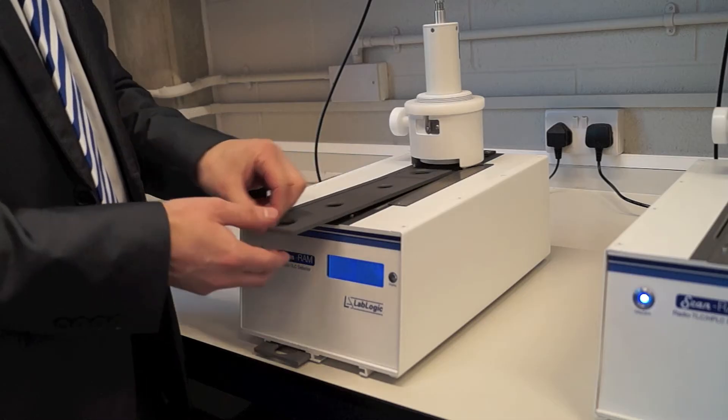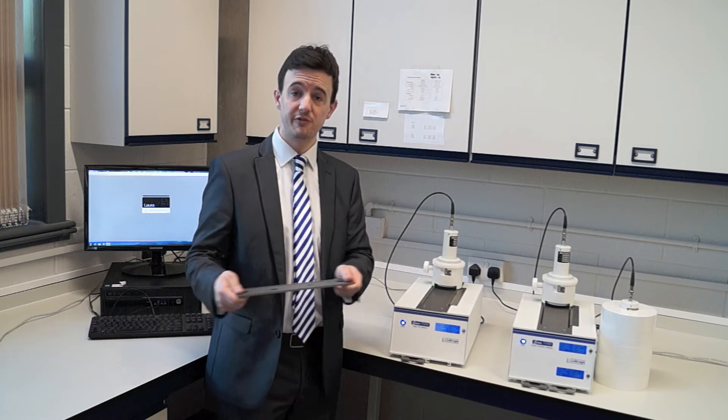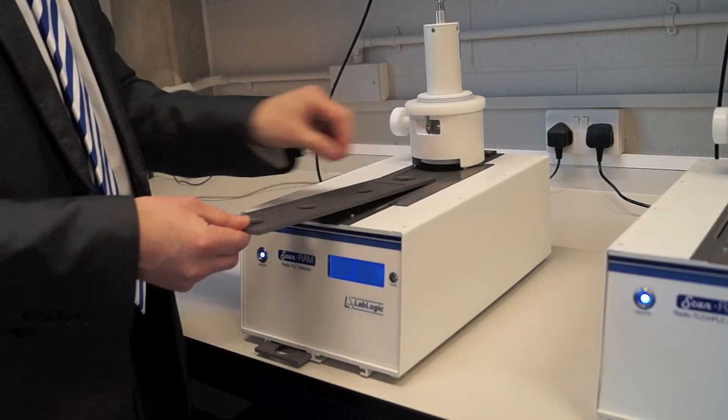The TLC strip itself is going to sit on the plate holder. Holders are useful for transporting the TLCs to and from your development chambers — it's going to save the operator valuable finger dose and also save you getting contamination on the hardware itself.